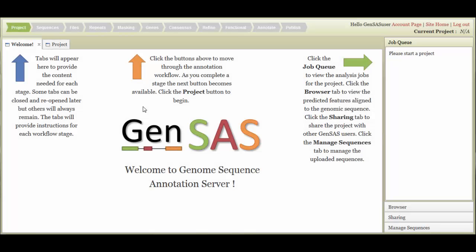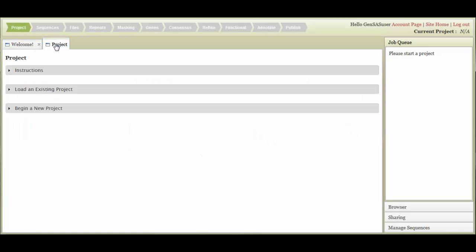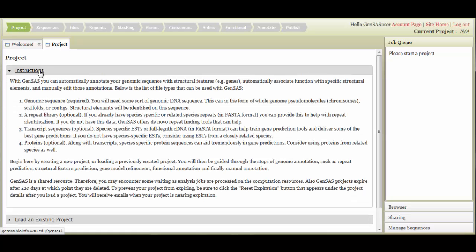To get started in GenSaaS, the first step is to open the Project tab. Under the Project tab, there is an Instructions section that can be viewed or hidden by clicking on Instructions. All tabs in GenSaaS have an Instructions section that describes how to use the tab in lieu of a user manual.